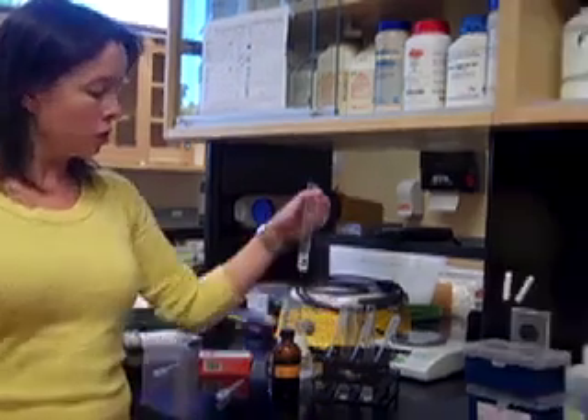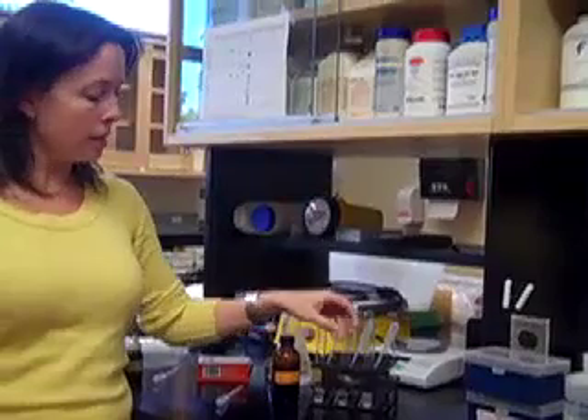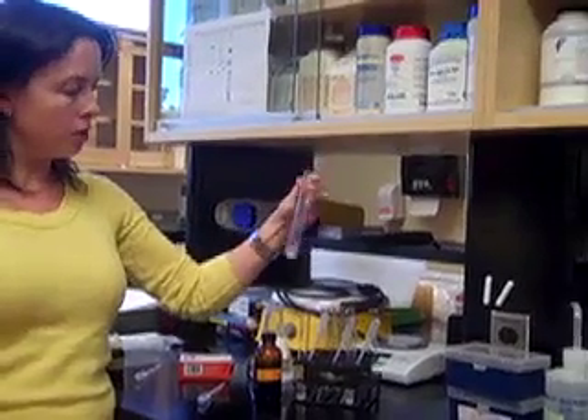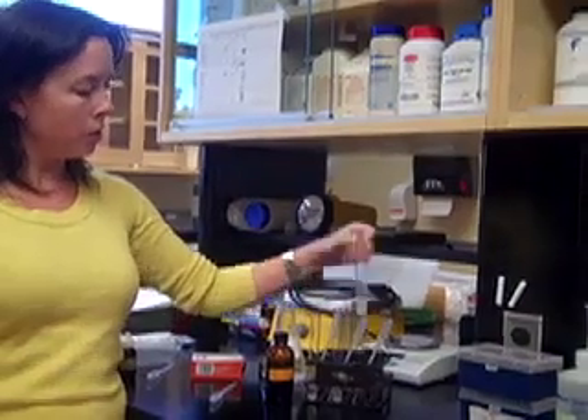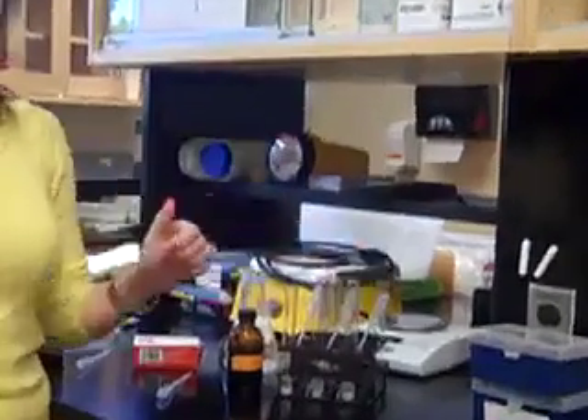In this lab, the idea is to test the effects of salivary amylase, which is in your saliva and it digests starch. So I've set up three test tubes already. The first test tube has saliva and water in it. The second test tube has water and starch, and the starch is kind of settled to the bottom, so I need to make sure I shake it before I take any samples. And then my third test tube is saliva and starch. I used my own saliva for this.